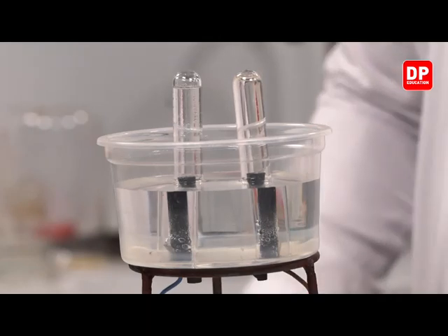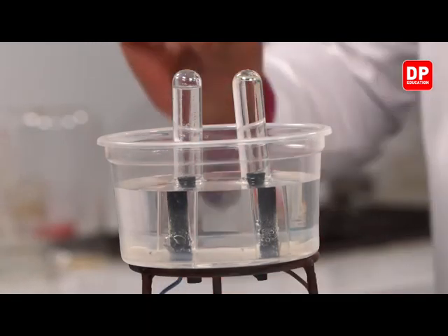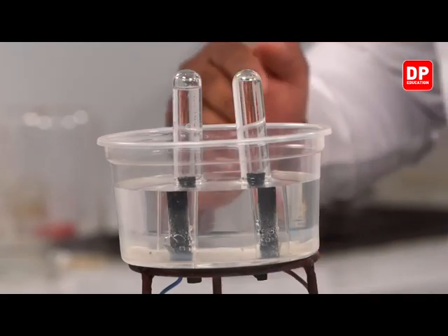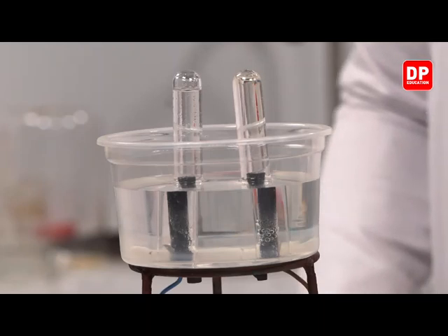So we have to collect. In order to get a good observation, we have to collect gases up to a certain kind of height. So it's still in the initial stage. So we have to keep the system for a longer time to collect a certain amount of gas. So once again, let's keep the system for a while and let's observe.